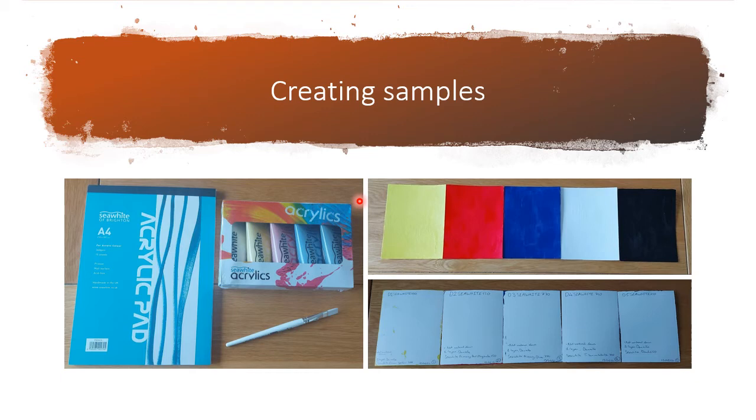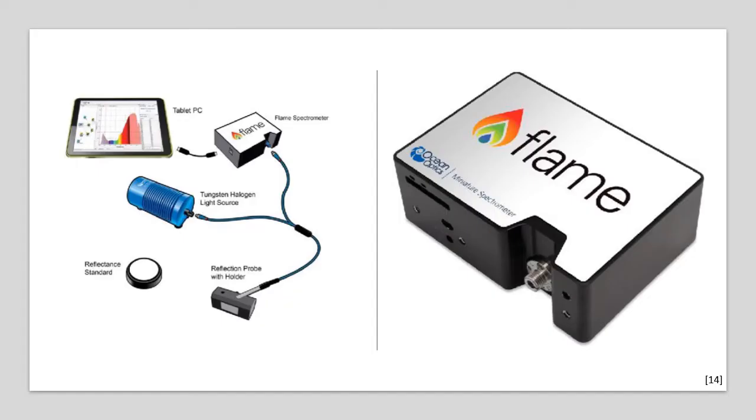We also plan to experiment with mixtures and layers. I think it will be interesting to see what we find with layering. My prediction is that if we layer different paints on top of each other before they dry, we will be able to detect a significant amount of the pigment beneath. I'm also interested to find out how much variation we find in spectra taken from paints that are supposed to be the same colour, but are different brands, or even if they're the same brand, but from a different batch.